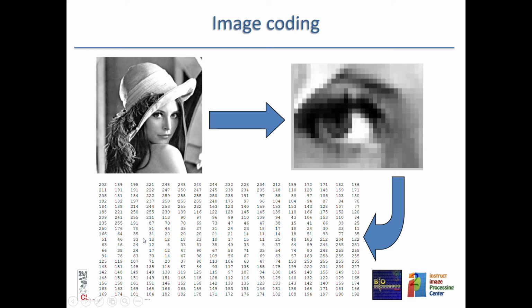The images that we collect in cryo-EM are gray images, and so for every pixel we only need to keep a number. This number may be normalized, so it doesn't need to go from 0 to 255. It can go from 0 to 1, or -3 to 3, or an arbitrary range with 0 mean.